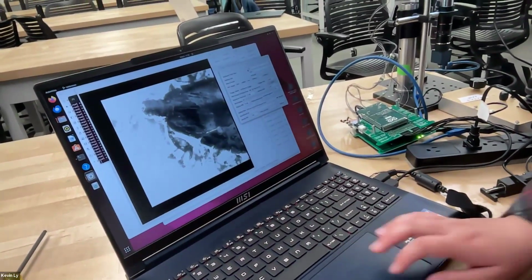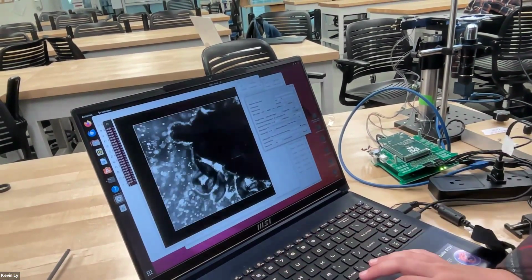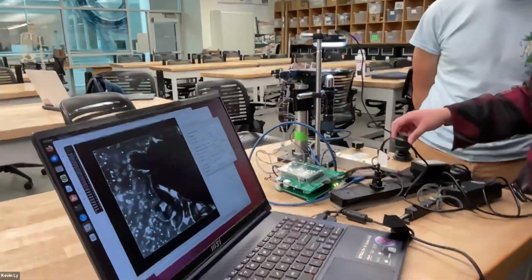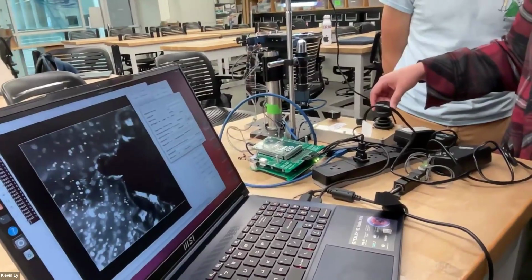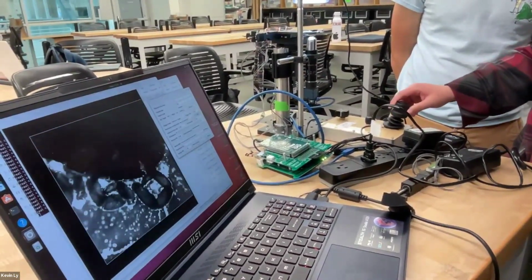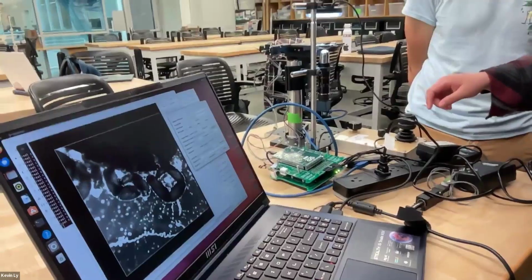If there are any semi-transparent parts, sometimes if you saturate them, you can see, but I don't think there's much there. But yeah, so these are the legs. Whoa, that's the head. A joystick. Oh yeah, it's very much like a game controller setup. There's a cool looking leg. Jack's blood in there, by chance? Oh, maybe.